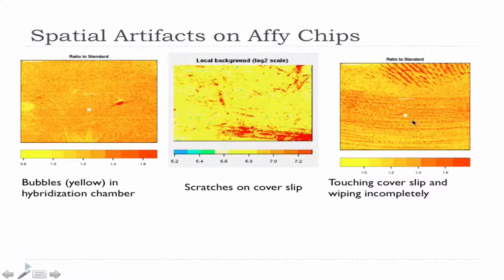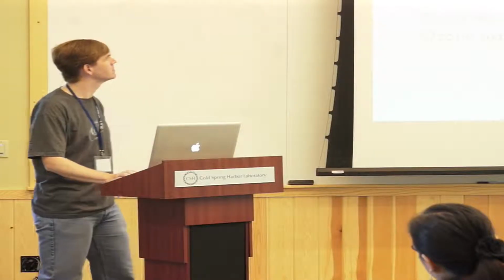Anybody want to try to identify the person by the fingerprint? So when you see things that you don't understand, you need to start pulling in as much data and information as you can. And Bioconductor tries, with the platforms that it knows about, to give you as much of that information, and often in a convenient way, so that you can do these kinds of things relatively easily.